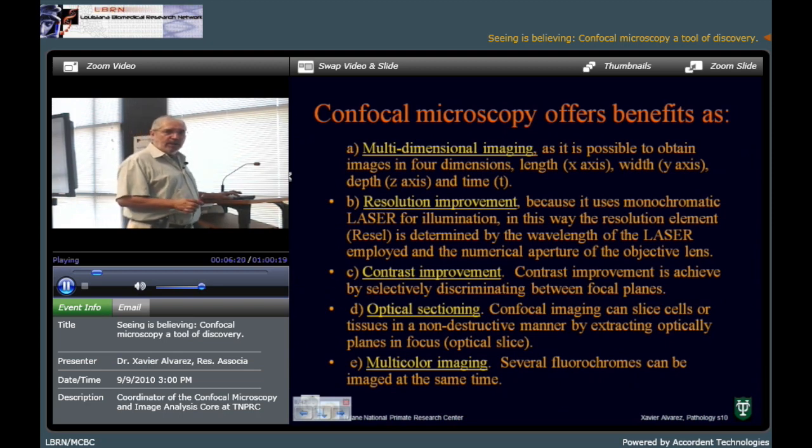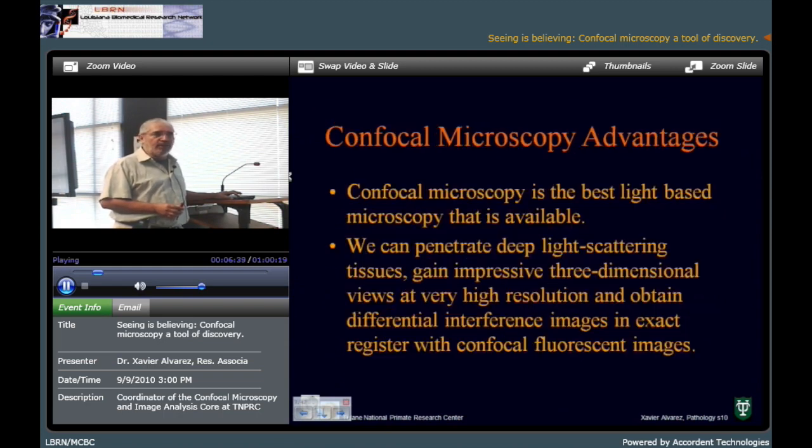And nowadays we could do pictures with many colors. Normally in our facility, 3 colors, with very good planning 6 colors. Okay. With the new microscope, I hope that we could do at least 8 and probably 10. Okay.